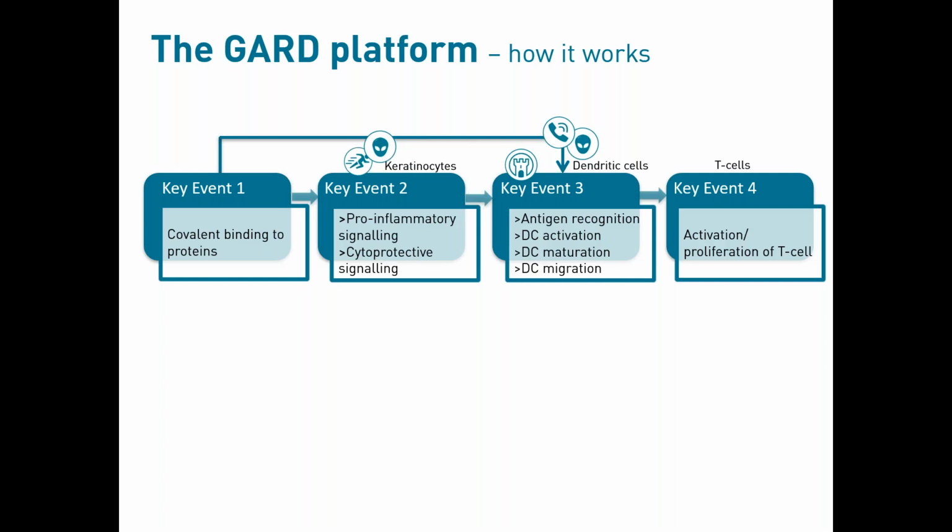So if you start to actually map some of the 200 genes to this AOP, you can see that we already measure, for example, CD86, which is the only biomarker measured in the h-CLAT assay. And we also measure those genes that are involved in the NRF2 pathway, which is basically the only endpoint that is measured in the KeratinoSens assay.